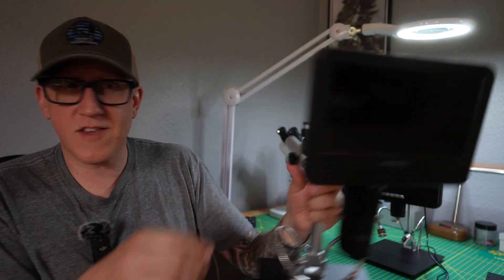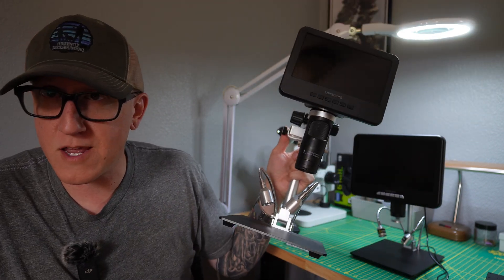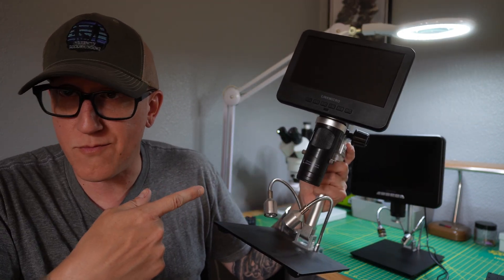Going back about four years, I did a deep dive into the world of digital microscopes, and I found that they were junk. Fast forward three years from that point — a year ago — I got this. This is the Link Micro digital microscope.